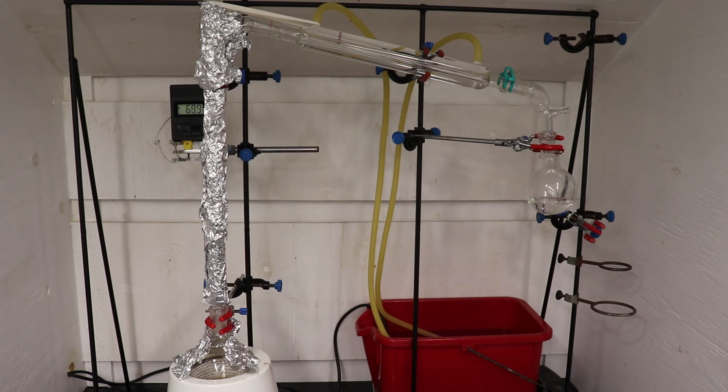During this time, the ethyl-2-bromopropionate, which boils at around 160 to 166 degrees Celsius, began climbing up the column. Soon enough, the stillhead temperature began rapidly climbing, and distillate was starting to be collected.